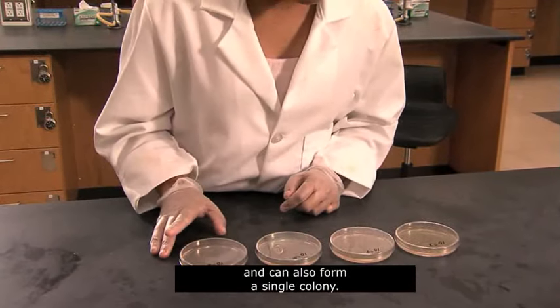To obtain a statistically reliable estimate of the quantity of bacteria in your sample, select the plate that contains between 30 and 300 colonies. In this set of plates, that would be the third plate. Plates with too many colonies to count are labeled TNTC, which stands for too numerous to count. Plates that have fewer than 30 colonies are labeled TFTC, which stands for too few to count. Not all colonies will be on the surface because some bacteria were trapped in the agar as it solidified; these colonies are noticeably smaller and elliptical. Even these embedded colonies must be counted.